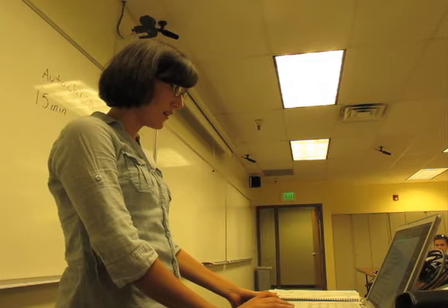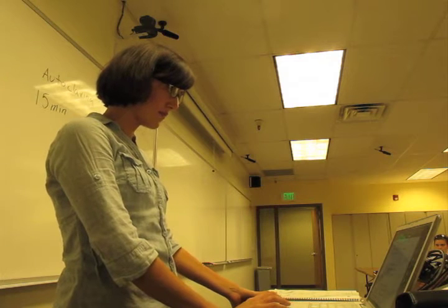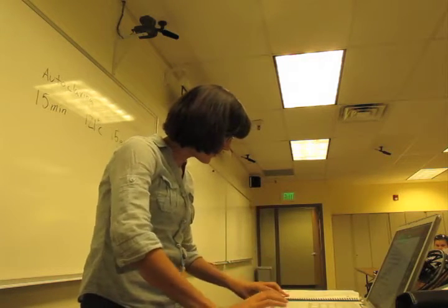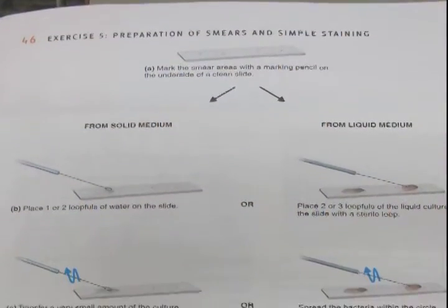So this was a pretty simple lab. I would go over this and just remember how you inoculated the slide.